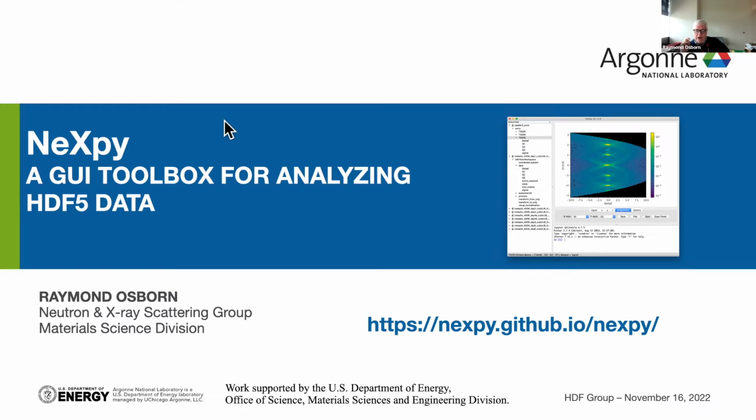And although, as its name implies, it focuses on the Nexus data format, which is something I've been involved in since its inception nearly 30 years ago, nevertheless, all Nexus files are now stored as HDF5 files, and most aspects of most of the tools are actually fairly generic. You can read virtually any HDF5 file and ignore the Nexus trappings, except for a couple of things I'll mention.